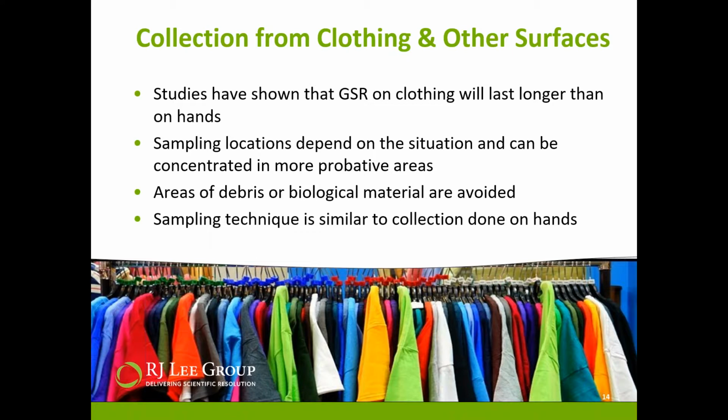RJ Lee Group does not use a cutoff time. We feel that if you feel it's probative to have the samples analyzed, then we'll analyze them for you. But we do want you to be aware that particles are lost over time. If it has been a longer time since the discharge, you do have the option of collecting samples from the subject's clothing or another surface that the subject may have been around. I've collected samples from watches, from purses, from shoes, from wallets, different things that the subject may have touched or been around. Studies have shown that gunshot residue on clothing can and will last considerably longer than on hands.